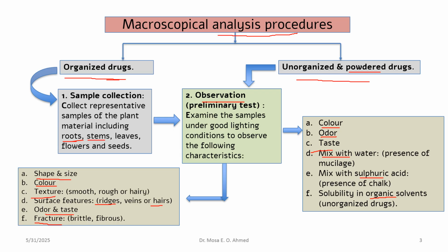For unorganized drugs, we directly observe the sample under a good light condition, and we note the color, odor, taste, besides other specific tests for powdered drugs, the use of water, the use of sulfuric acid, and use of organic solvent. And note the difference in observations to be identified for organized and for unorganized drug.